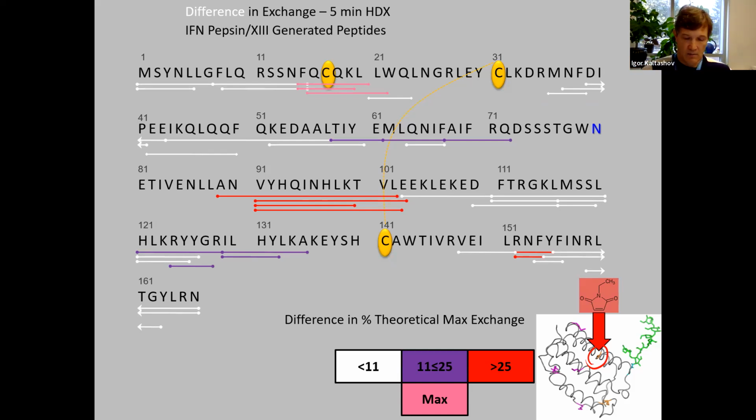So here, if you do HD exchange, you would observe that there is a group of peptic fragments underlined in red that seem to be located far away from the cysteine in question, right? So this is the cysteine that we are conjugating to NEM. But we see a lot of difference in dynamics between the intact and conjugated version of the protein in this particular region.